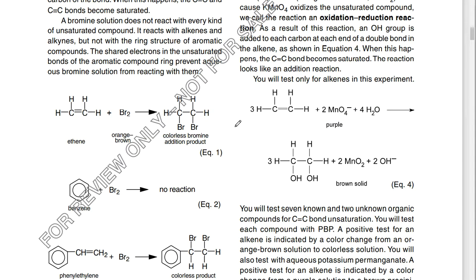Something else that we probably have talked about at this point as well is not just nomenclature of alkanes, but reactions of alkanes. So here is an example, and this is giving me ethene. Eth, 2 carbons, 1 and 2, and ene means a double bond. So there's a double bond in the middle. So there is ethene, and we are reacting this with bromine.